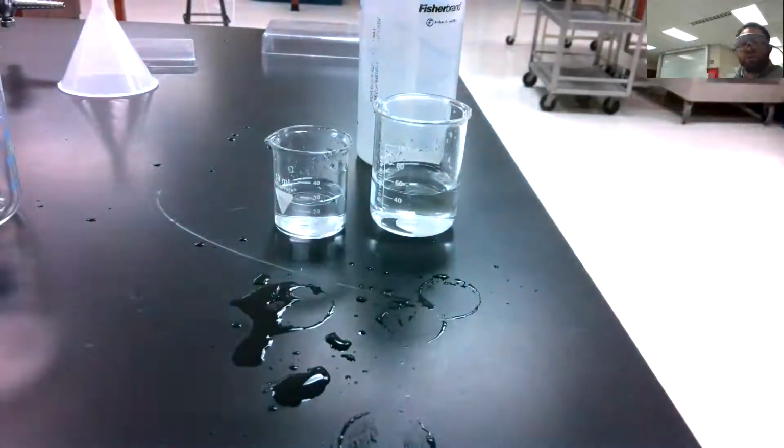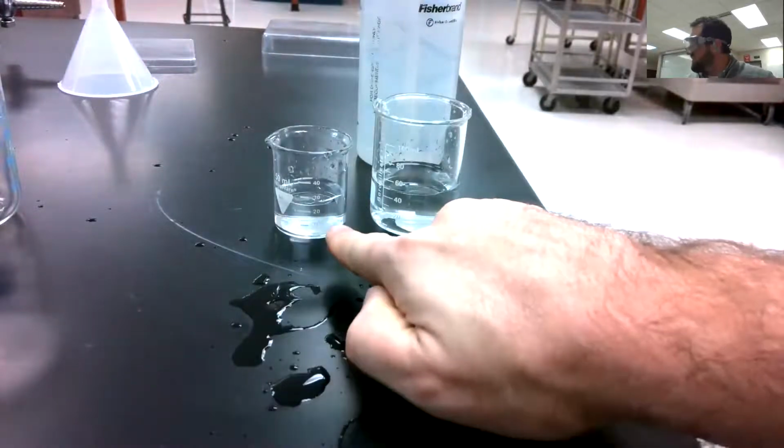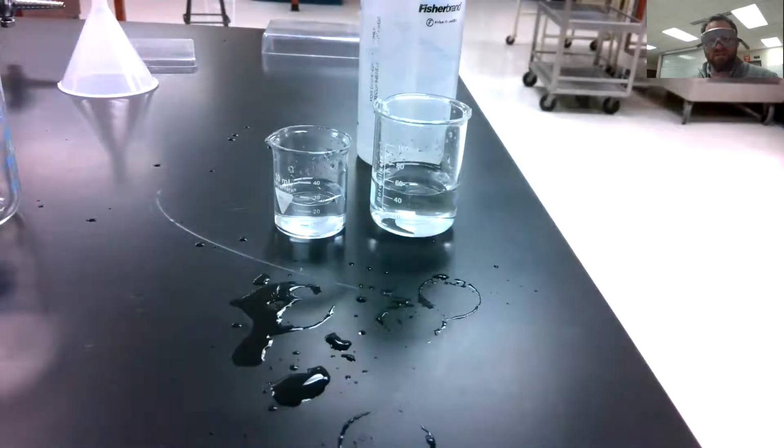two perfectly clear substances. They aren't. We know. You saw me put those salts in there. So there are dissolved salts in there, but that's what it means to be aqueous. Dissolved in water, you can't see them. I can't see them. It's almost like they aren't there. Clear water.